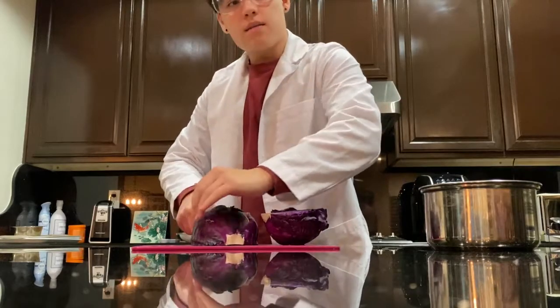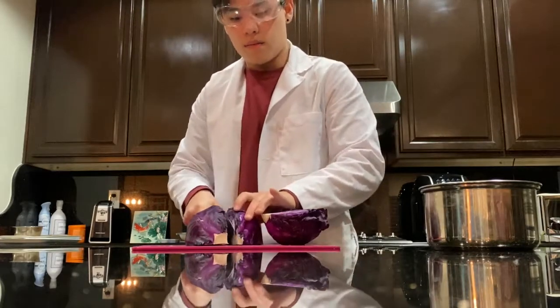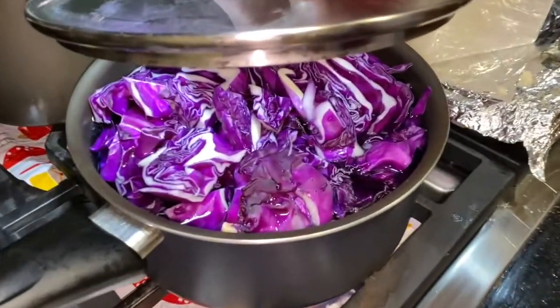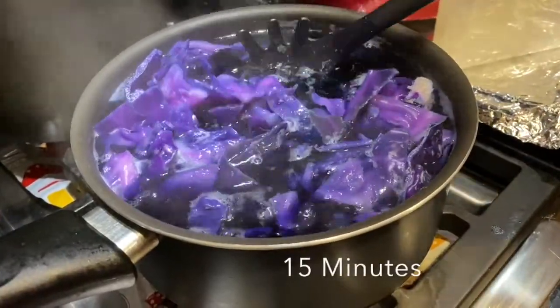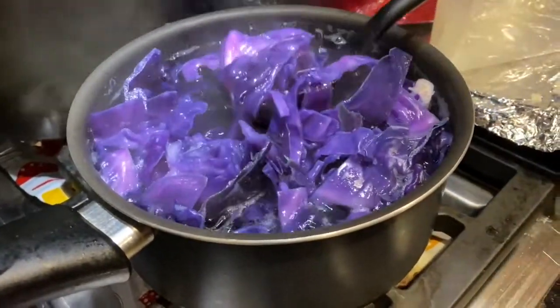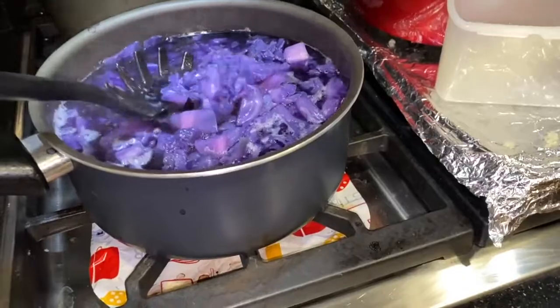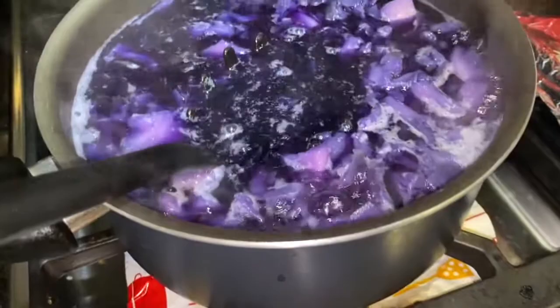Don't forget to put on your lab goggles and lab coat. Here you can see me cutting the red cabbage — it's going well so far. The hot water is breaking down the cell walls of the red cabbage so that the anthocyanin can get out into the water. You'll see the water getting even more purple as time goes on. This is the solution after about 30 minutes — it's pretty purple now and a lot of the color has been drained out of the cabbage.